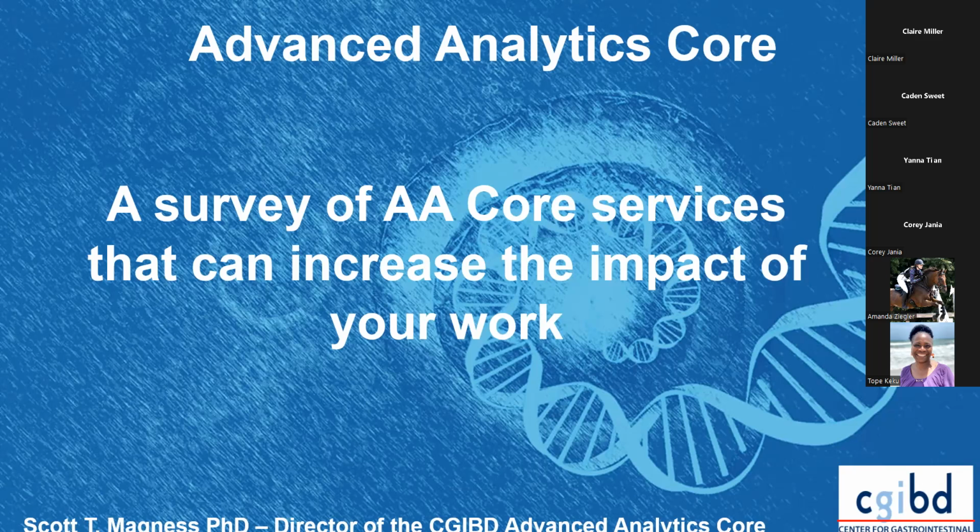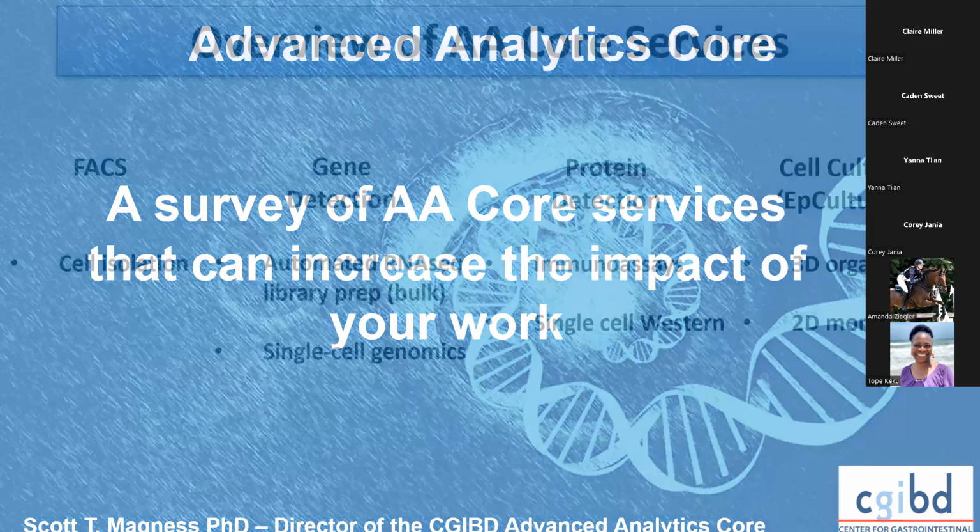It fell into this idea of what is the most sophisticated technology we could provide, from genomics to protein analysis to single cell analysis to new organoid culture services. So it fell into this big broad umbrella of sophisticated technologies, and we call it the Advanced Analytics Core.